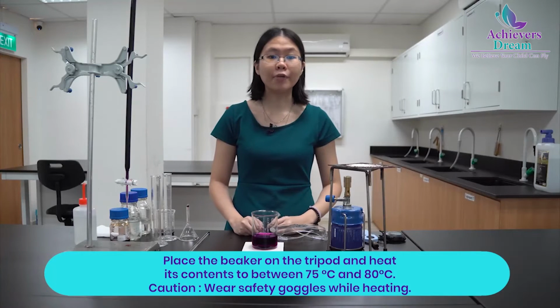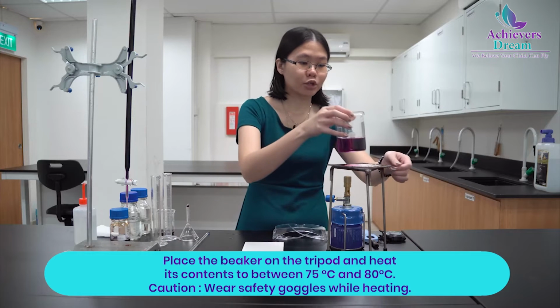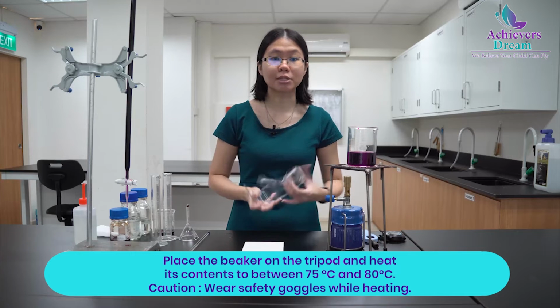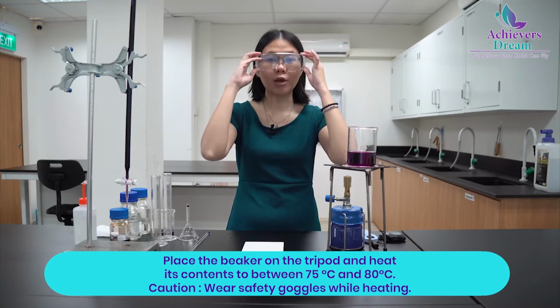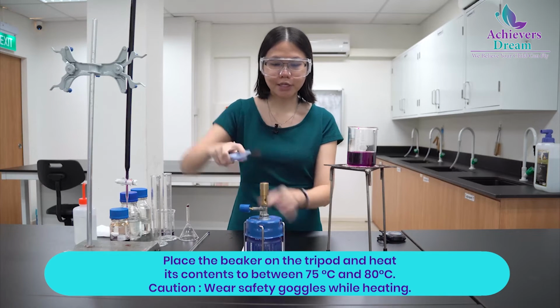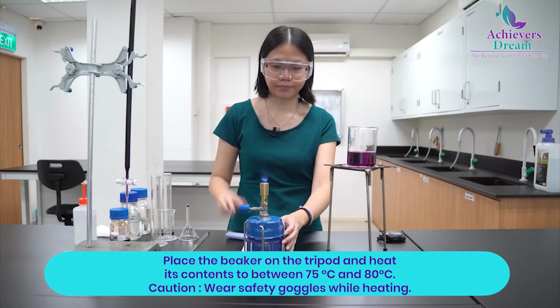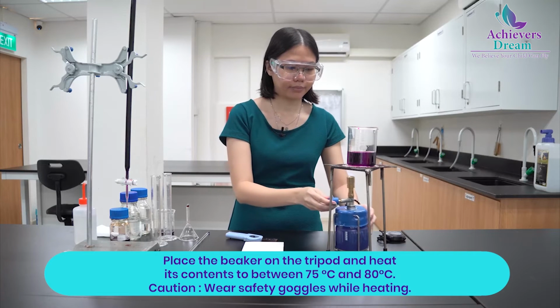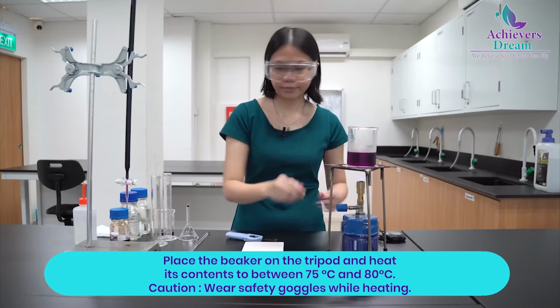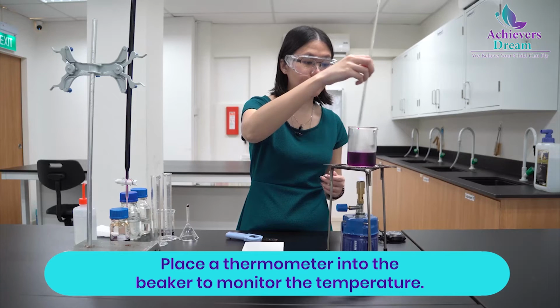For the next part of the experiment, you need to heat up your beaker. Okay, so place your beaker onto a tripod and heat its content up to between 75 degrees Celsius and 80 degrees Celsius. Okay, remember to wear your safety goggles. Okay, so you will turn on the Bunsen burner. Then put the thermometer inside and monitor the temperature.